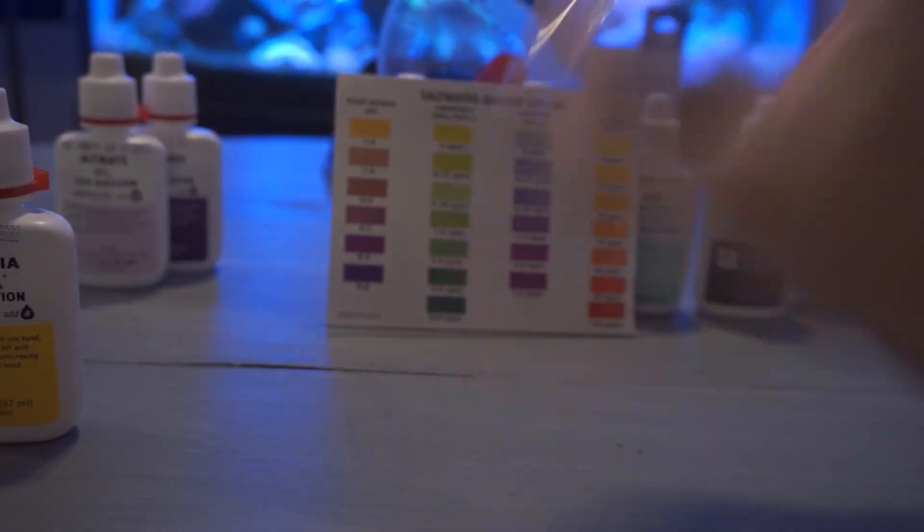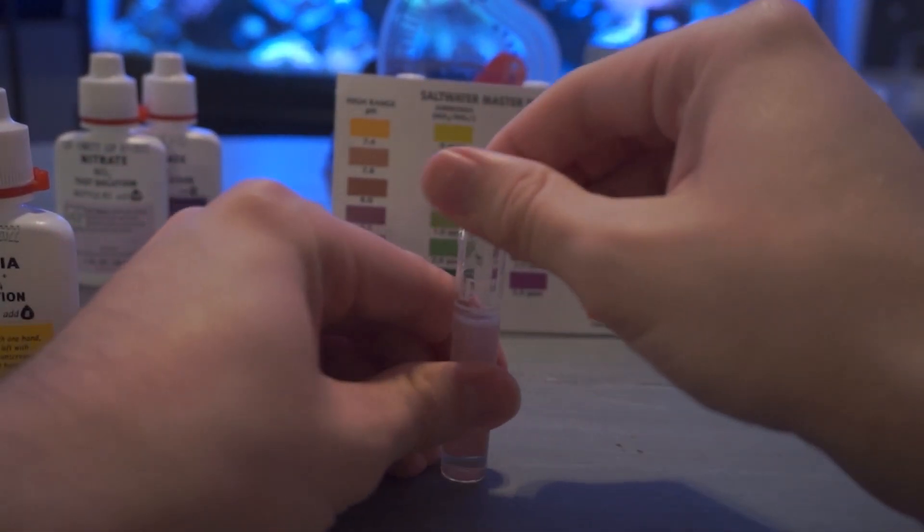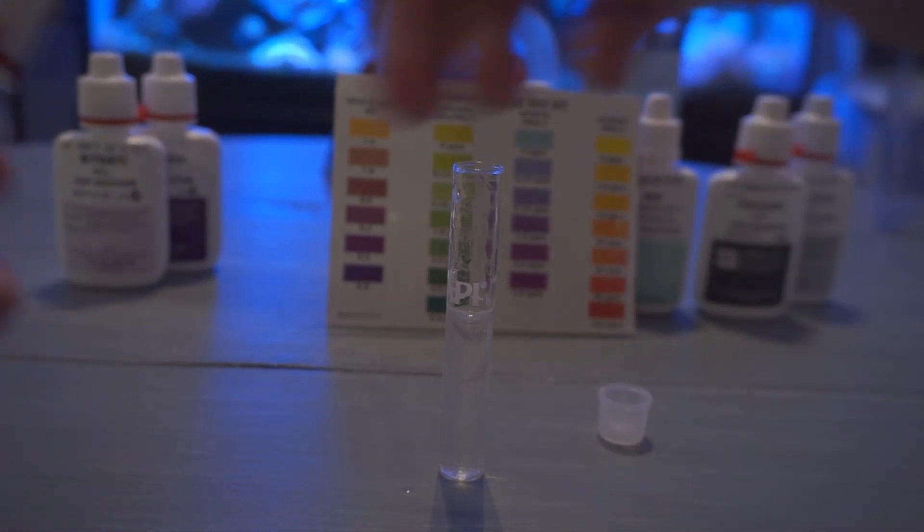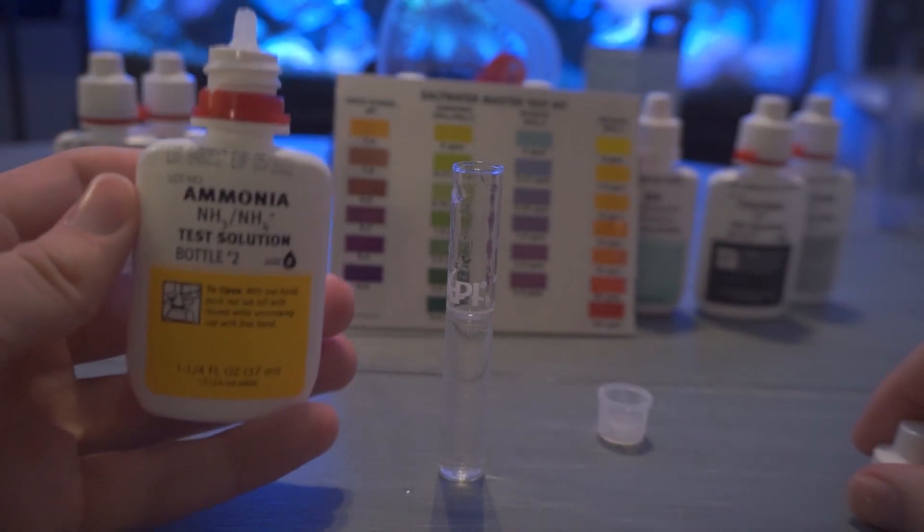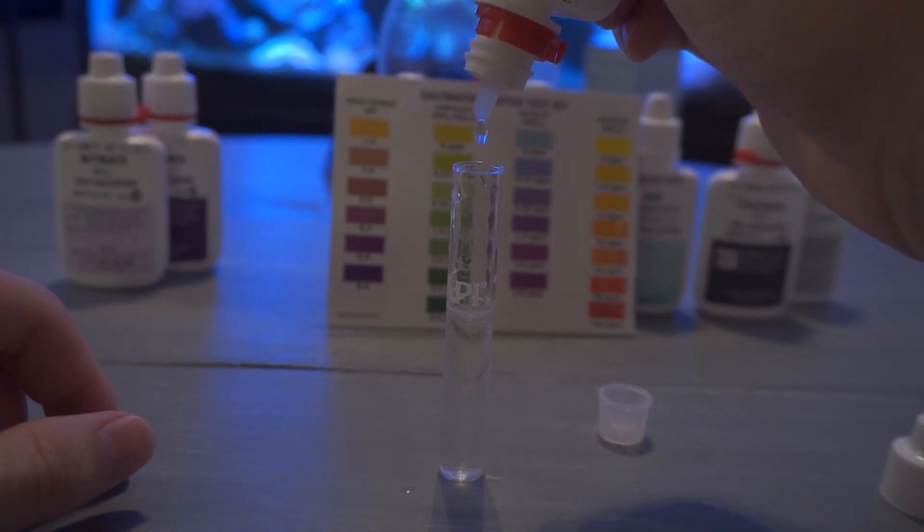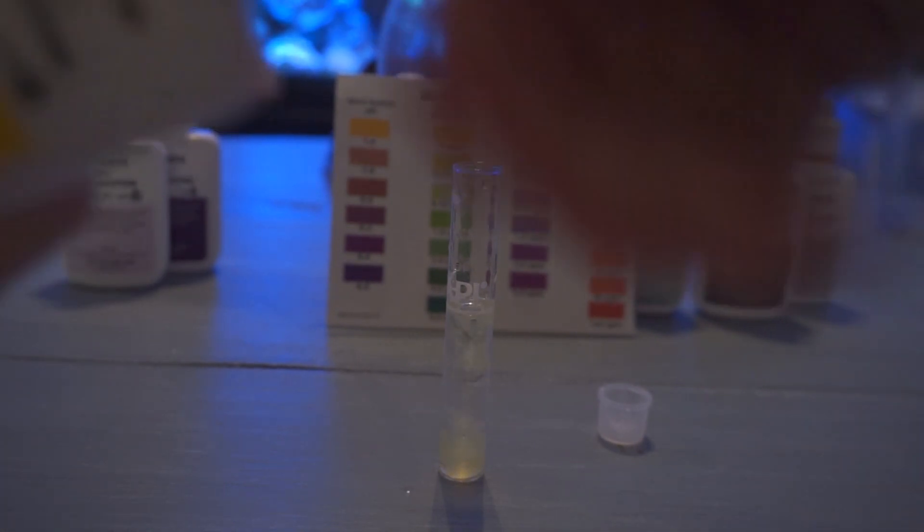So once we put eight drops of bottle number one we're shaking it up for about 10 seconds, putting the cap off and dropping in the next bottle, bottle number two, at eight drops. Now once we put these in here we'll definitely start to see a more coloration and especially whenever we shake it up. Ammonia is probably the one that has to sit the longest in my experience to actually change to a certain color. So give it some time once you put it in there. Shake it up and let it sit.